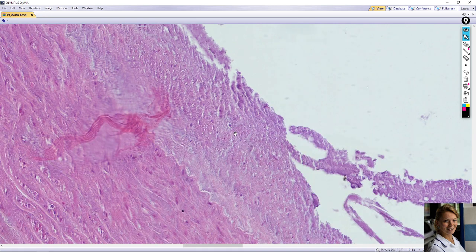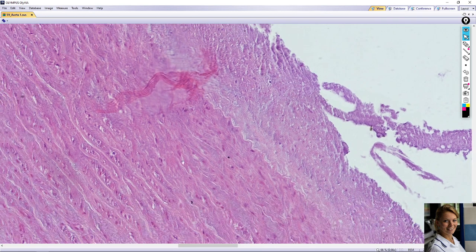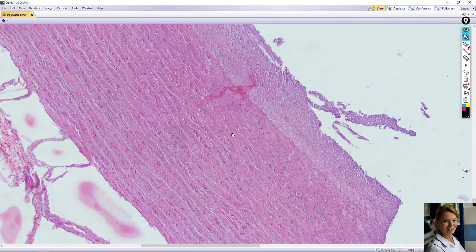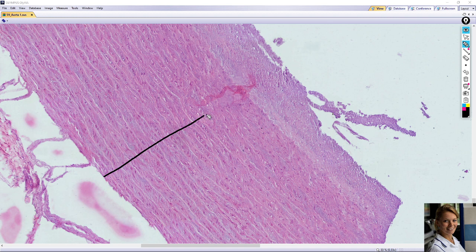Instead of smooth muscle fibers, the elastic fibers constitute the bulk of the tunica media, with smooth muscle fibers less abundant than in a muscular artery. Here is the tunica media, and fine elastic fibers form thick elastic membranes — visible here as colorless elastic membranes in the tunica media.